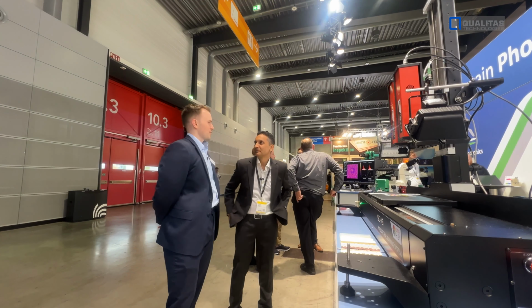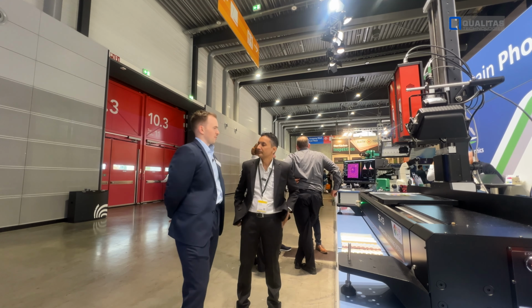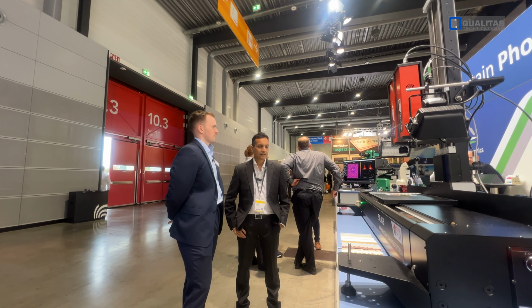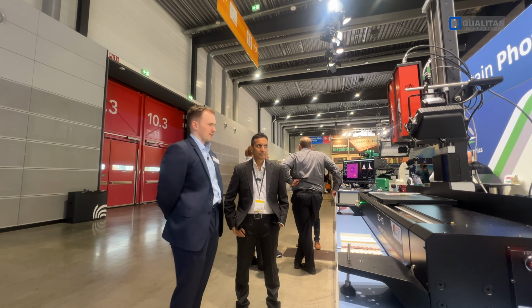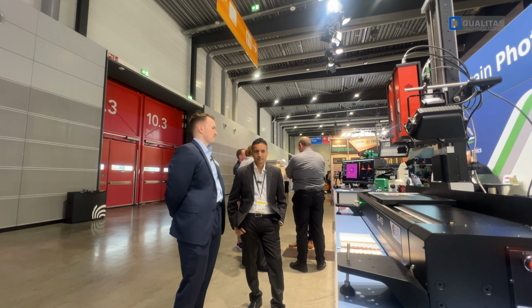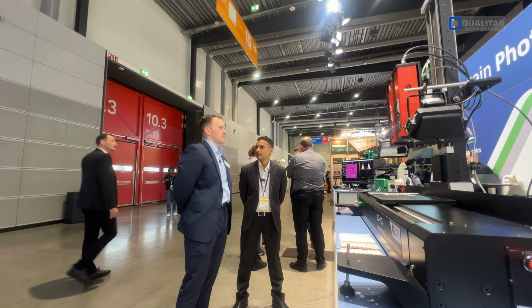So we make and measure rainbows, manufacture complete hyperspectral imaging systems, which simultaneously record spectral and spatial information across a wide spectral range, all the way from the visible or even the UV to the shortwave infrared, so from around 300 to 2500 nanometers. And that's super useful for a range of different industries because you can analyze spatial characteristics of samples, so size, shape, distribution, and all sorts of applications.